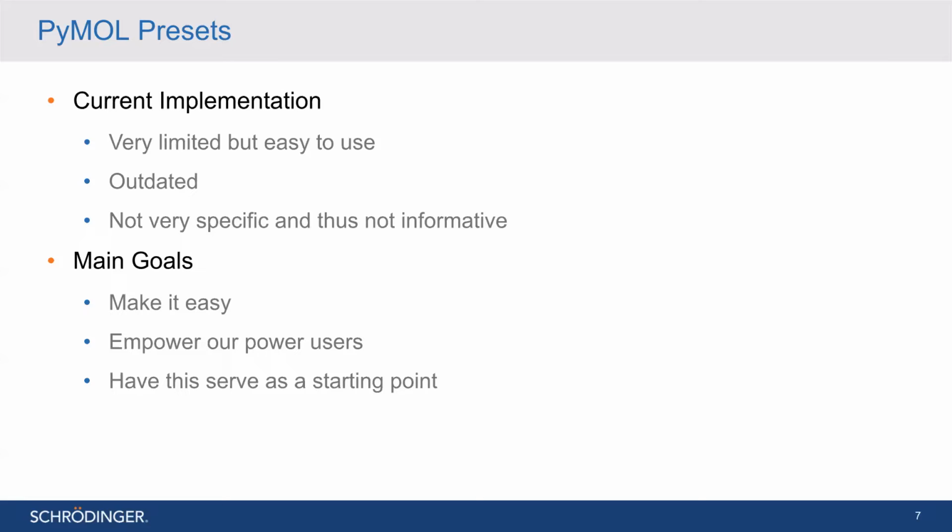So going back to our lab example, let's say that for your lab presentations in your membrane protein lab, you want everyone to have the same styling so that it's easier to tell differences between the different structures that you're going to be seeing that day, right? So currently, people have all different ways of showing their proteins, but it would be much easier to tell the difference between them if everyone was starting from the same general rules of styling.